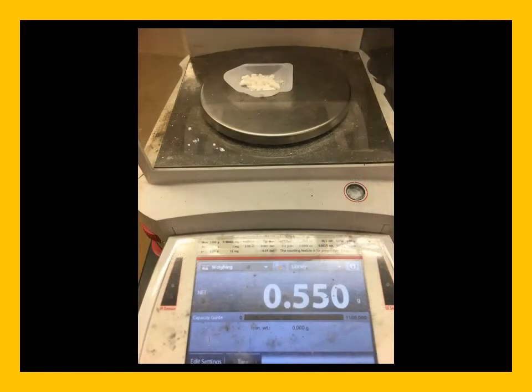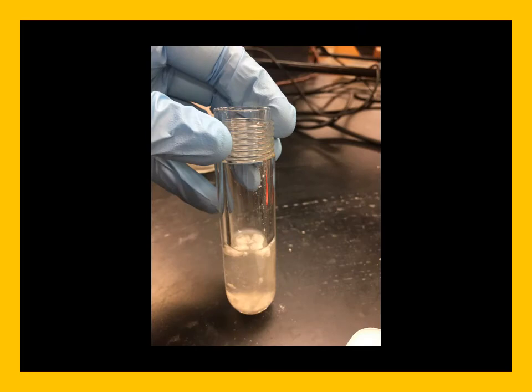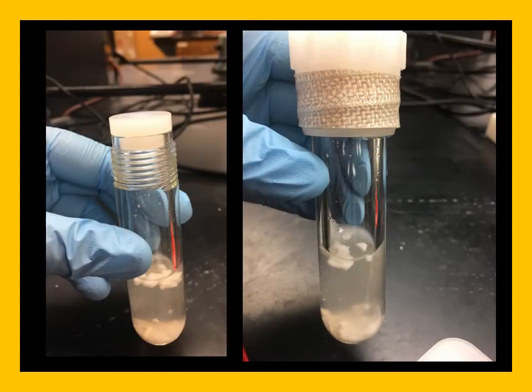And now I'm going to weigh out the dibromocinnamic acid that we synthesized last week. So we had exactly 0.550 grams. And you can see that I've added this, and I'm now going to add the rest of the potassium carbonate solution. Now, here we see the compound, which does not dissolve in the water, and we can see the lid assembly. There's an inner lid, and then there is a screw top lid on top of it. And it's really important that we make sure that there's no compound blocking the sealing of this joint. This is going to be under high pressure.